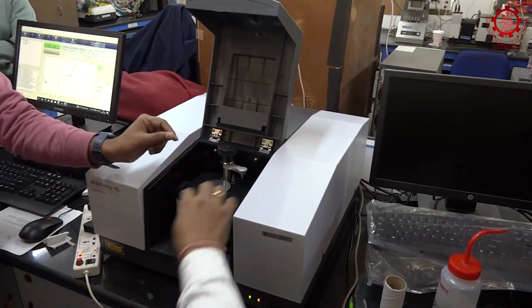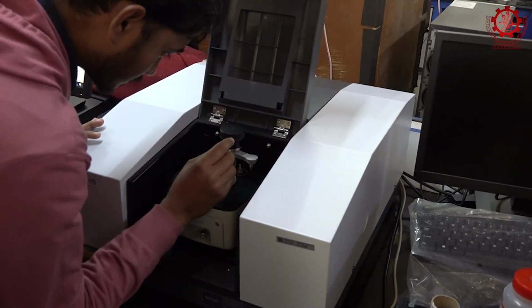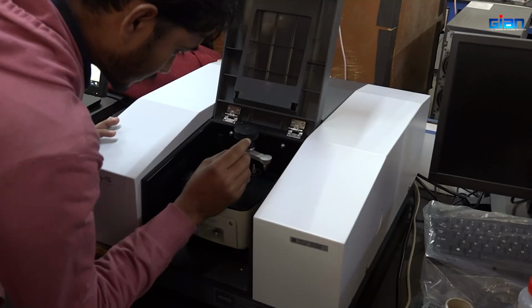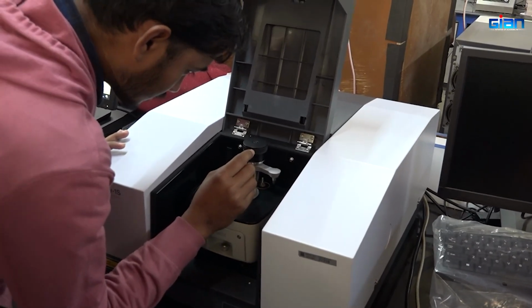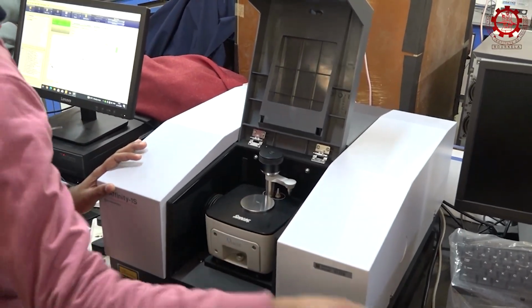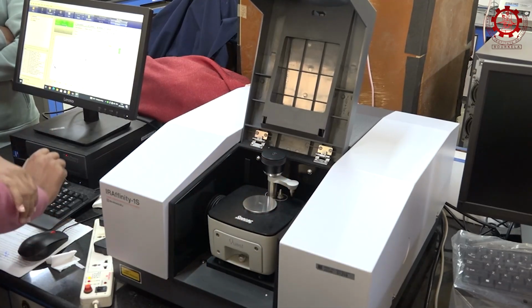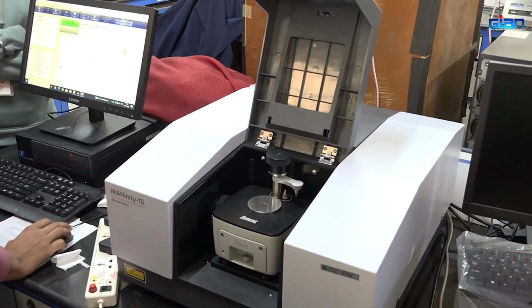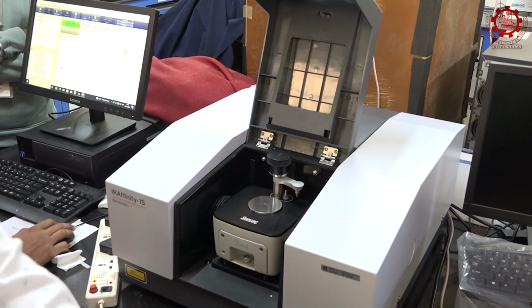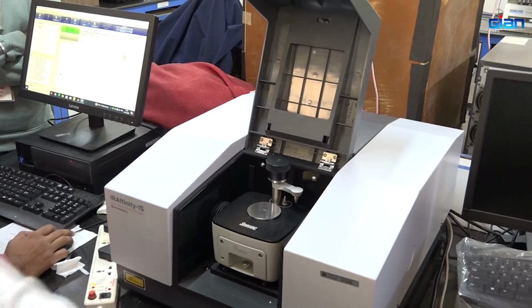Yeah. So now what we are trying to do is make a thin film. Okay, because the normal way, we make a solution. We take our compound and in organic solvent, we make the solution, and that one we put in there. But now there is the question, because the solvent also will absorb IR. So for that what we do, we use a volatile solvent, which evaporates easily. So now we put it and let it sit for some time, so the solvent will be evaporated.